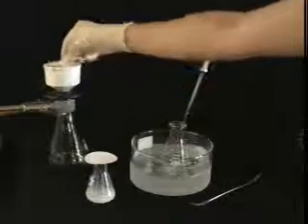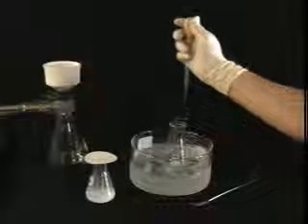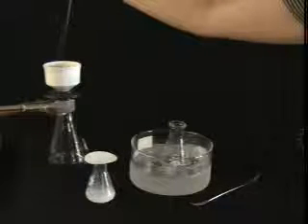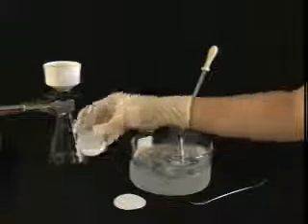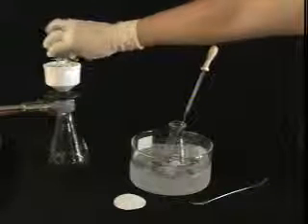The final step in a recrystallization is collecting and washing the purified crystals. To do this, you will need a flask of ice-cold solvent, ethanol in this case, and a vacuum filtration setup. Always use a clean, dry flask to collect the filtrate. In many cases, a second batch of crystals can be obtained by concentrating the mother liquor and crystallizing a second time. Turn the vacuum on and wet the filter paper with a small amount of cold solvent. Pour the crystals and the mother liquor onto the funnel, using cold solvent to transfer all of the crystals from the flask.